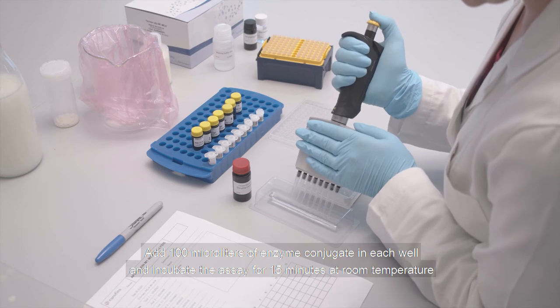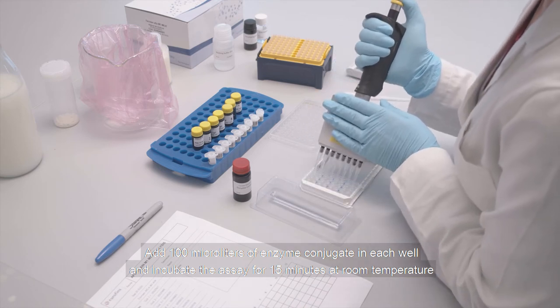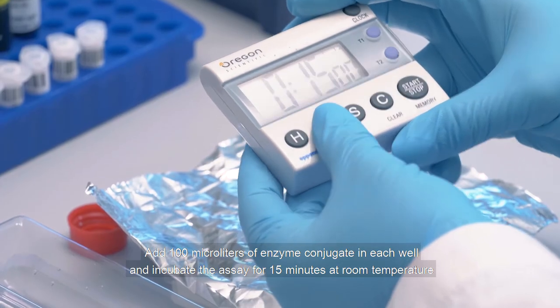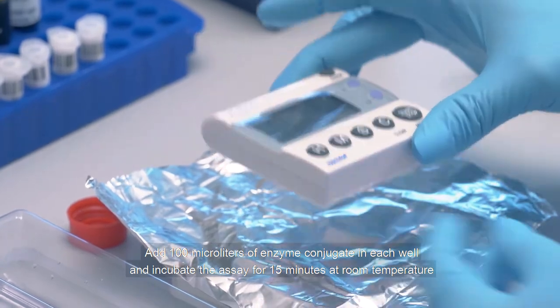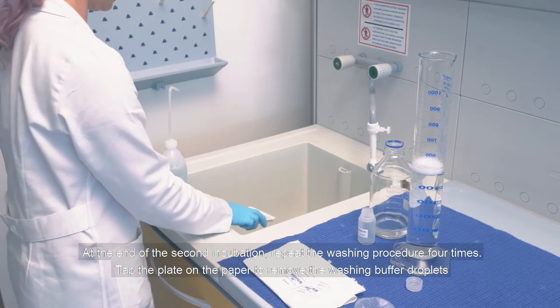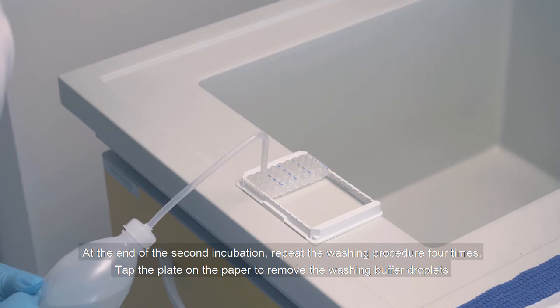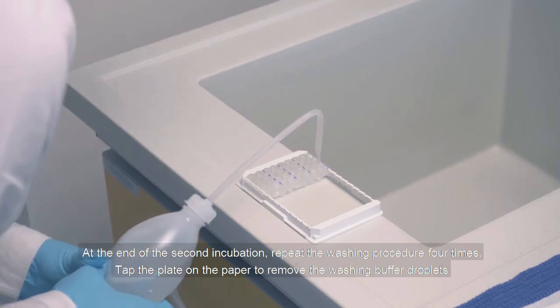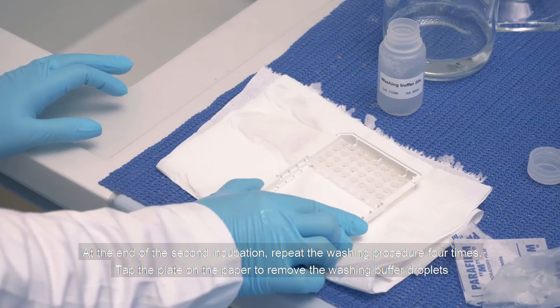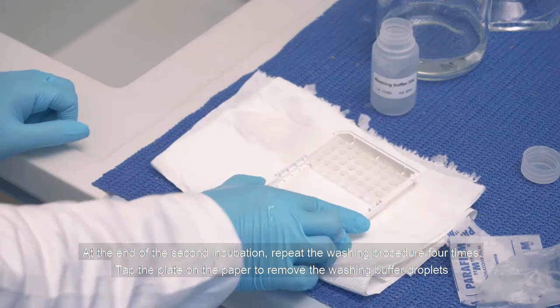Add 100 microliters of enzyme conjugate in each well and incubate the assay for 15 minutes at room temperature. At the end of the second incubation, repeat the washing procedure 4 times. Tap the plate on the paper to remove the washing buffer droplets.